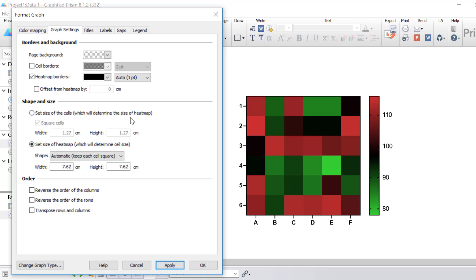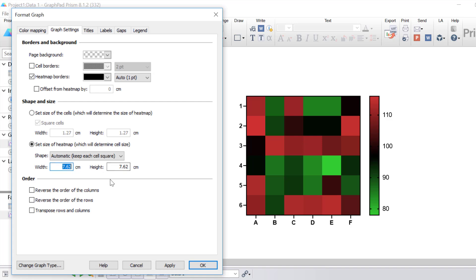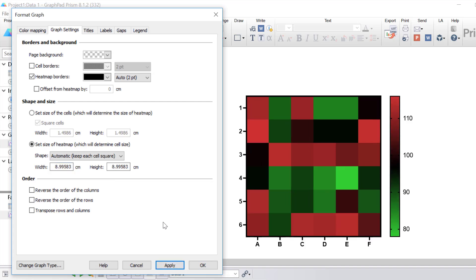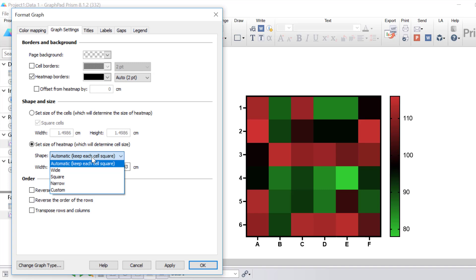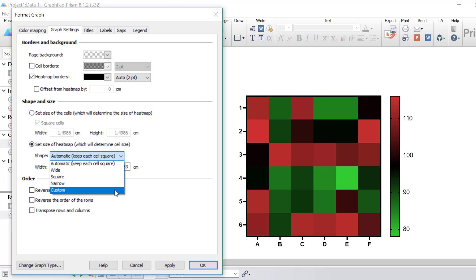You can also change the shape and size of the heatmap. You can choose to specify the size of each cell individually, or use the standard setting where the overall heatmap size is determined automatically by Prism. For example, if I change the width from 7.62 to 9 and click apply, notice how the map itself has changed to be larger. Instead of having square cells, you can use the dropdown to change these from wide, square, narrow, or custom.